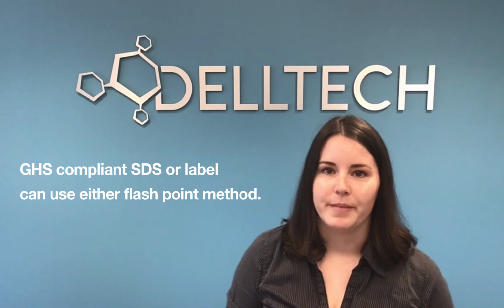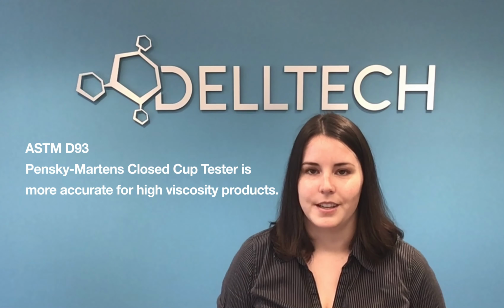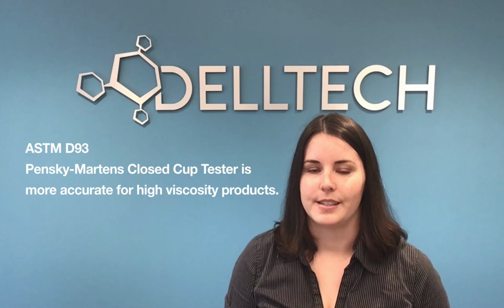If you need your test results to classify your product for a GHS-compliant SDS, that's Safety Data Sheet label, both methods could be used. The only difference between the methods is that the ASTM D93 apparatus, which is the Pensky-Martens closed cup tester, applies a mixing motion to the sample during heating, and therefore the flashpoint determination is more accurate for a high viscosity product.